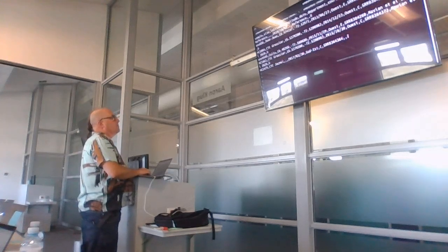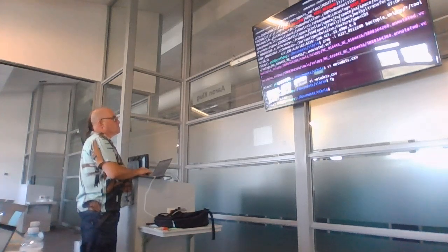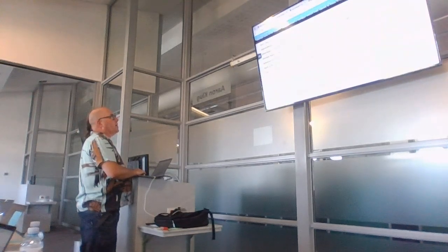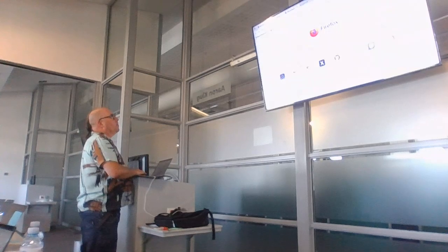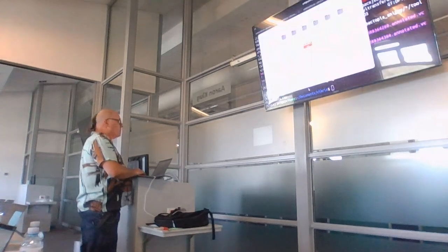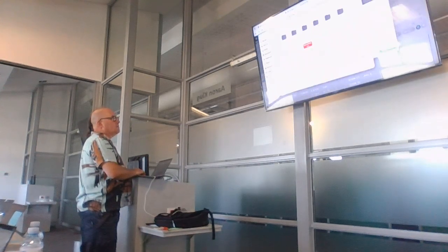Is this for Microreact? For Microreact, so we can have a look at it. Okay. And now I'm going to go back to my Microreact. I hope that I haven't messed up my format. I don't know if I can actually just drag straight onto this thing. Let me see what happens if I drag this onto here. Can I replace the metadata?